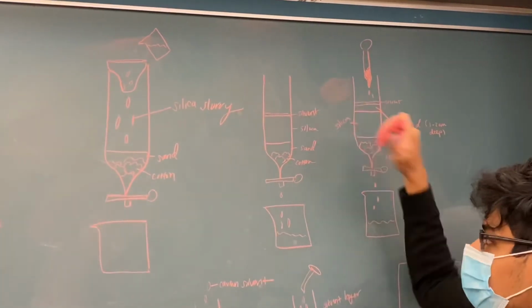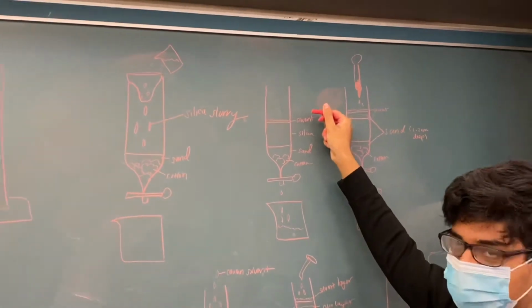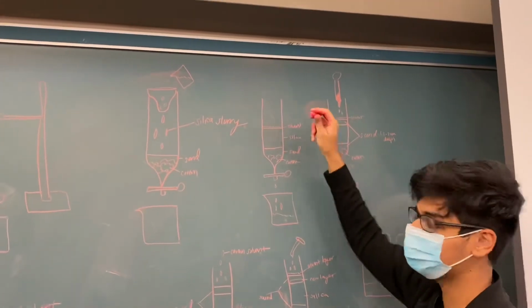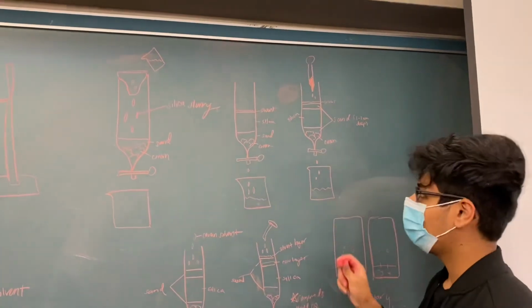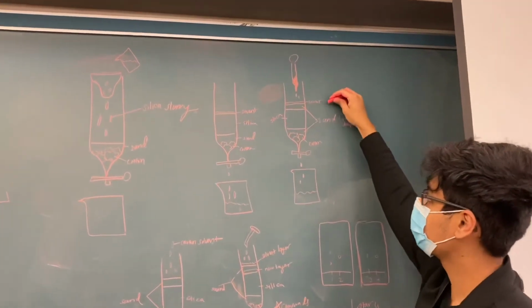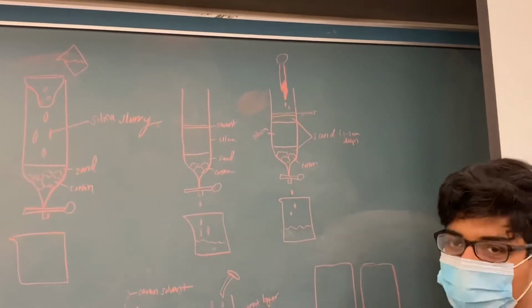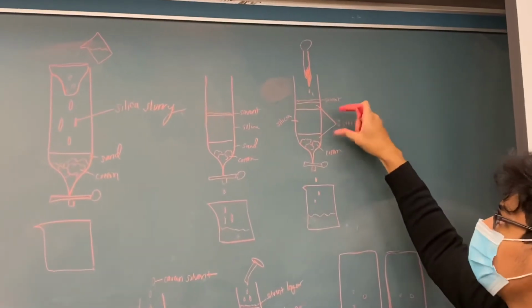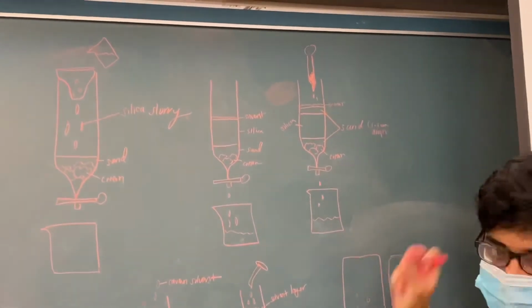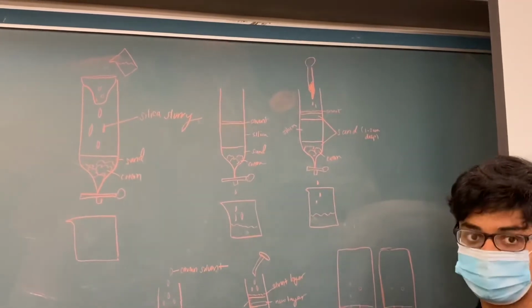Once you see that, you're going to start turning on the stopcock and drain out the solvent, which is the liquid above it, until it's a little bit above the silica layer, just a little layer. And then once that little solvent layer is there, you're going to add another layer of sand, about 1 to 2 centimeters thick. You're going to put that on top of the silica, and you should still see that little sliver of the solvent layer on top. Once that is in there, you're ready to put your sample in.